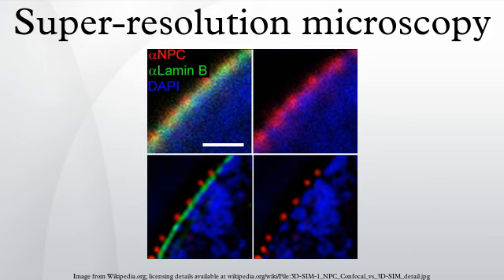SSIM requires shifting the illumination pattern multiple times, effectively limiting the temporal resolution of the technique. In addition, there is a need for very photostable fluorophores due to the saturating conditions. These conditions also induce radiation damage to the sample that restricts the possible applications in which SSIM may be used. Structured illumination microscopy enhances the resolution only by a factor of 2.